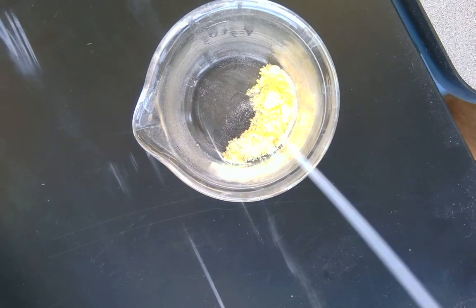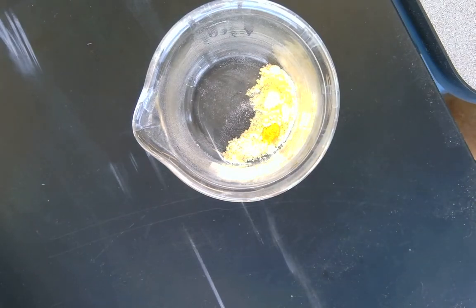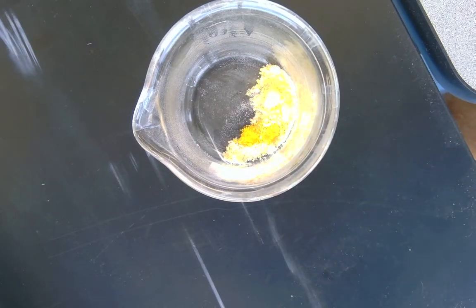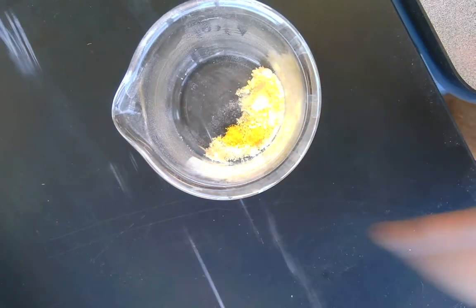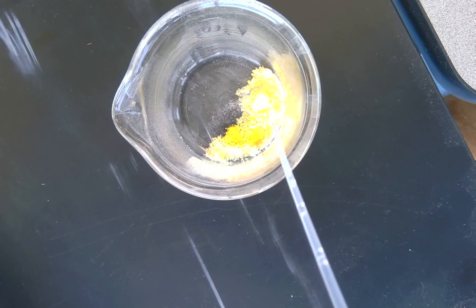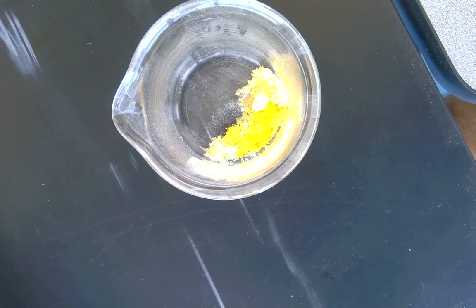But if I just add a few drops of water, watch how vivid that is, right? A little bit of water really picks those things up and lets them move around a lot. So where that water hits, they're really able to collide a lot now, right? I kind of mentioned it in the other video, but that's why we do so much of our stuff in high school chemistry dissolved in water. So many of them are solutions, so those things can be slamming around and bumping into each other. Because as soon as the water hits it, it helps those things move around, right?